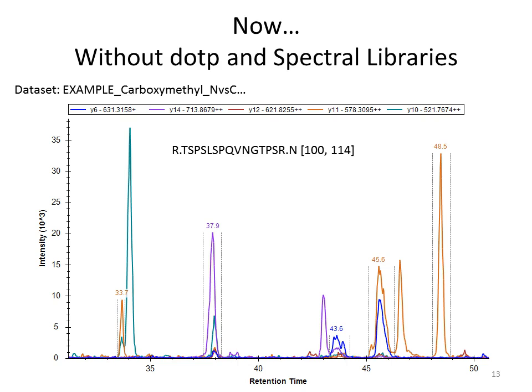And so a colleague of mine generated the spectral libraries in normal and cancer. That's what the N versus C is. The normal plasma was his own. He's crazy. He draws his own and preps it. And then we set up a targeted list. We didn't know what peptides to target because the customer just said, I have these 6 proteins. We're like, okay. So we based as much as we could off of the spectral libraries, but there were proteins that they had on the list that generated no spectral data. So you're like, oh, what do you do?